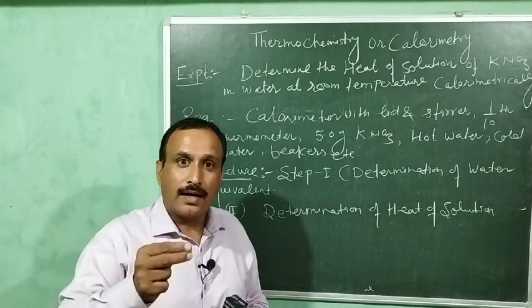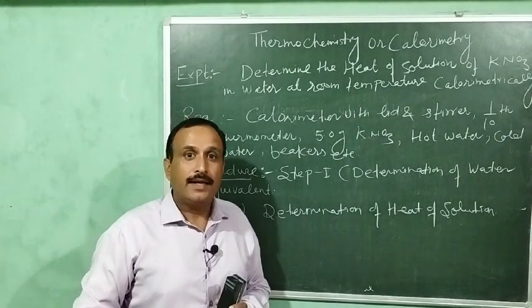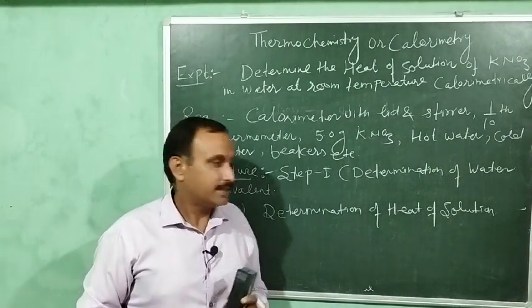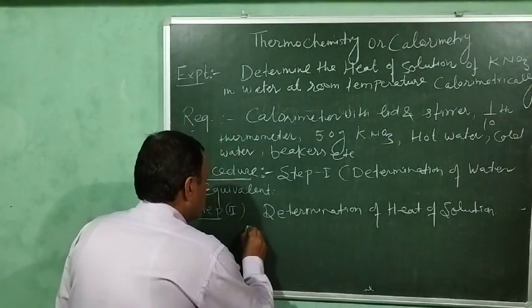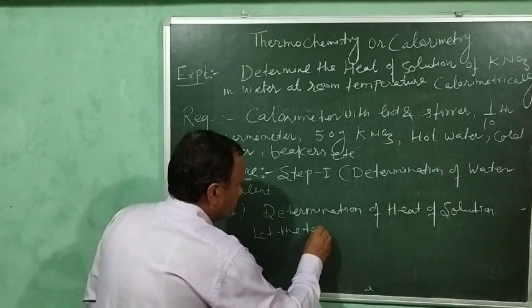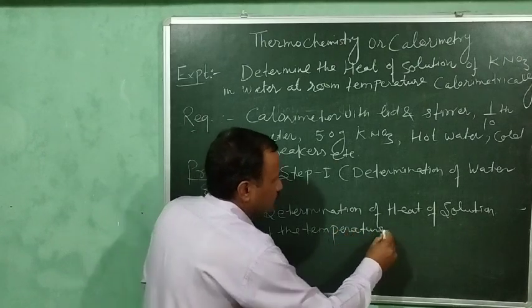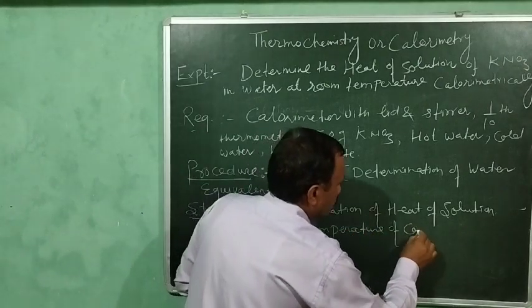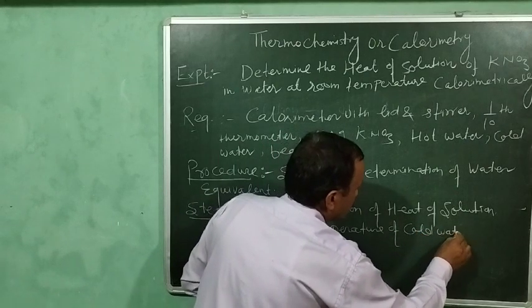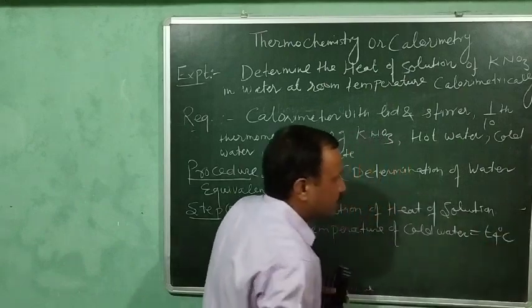Okay, and then we will note the temperature of this cold water and let it be T4 degree Celsius.